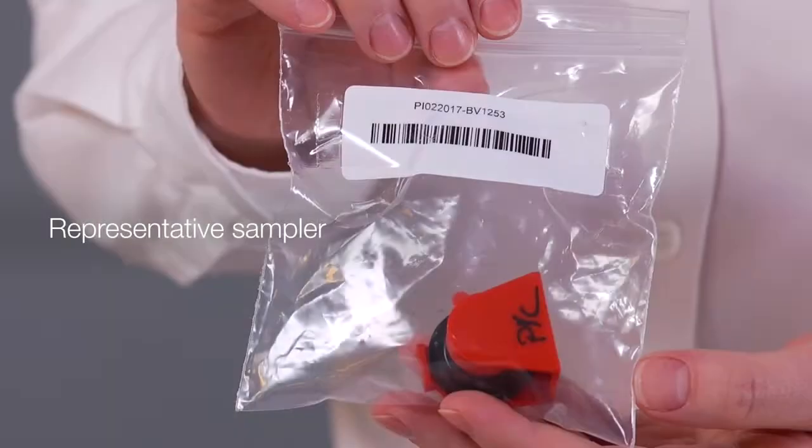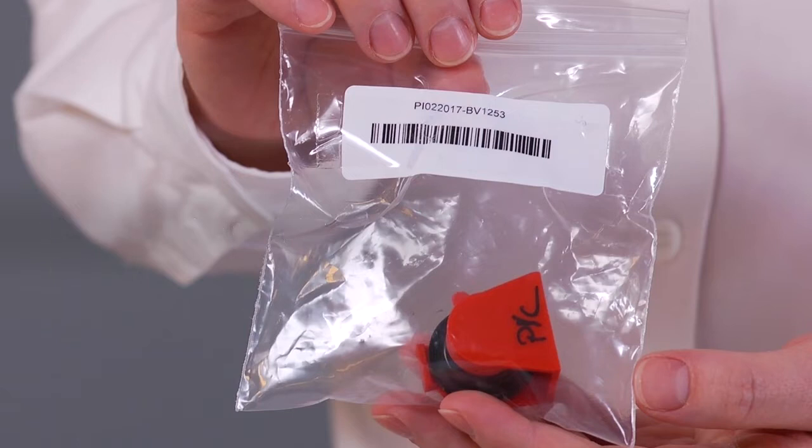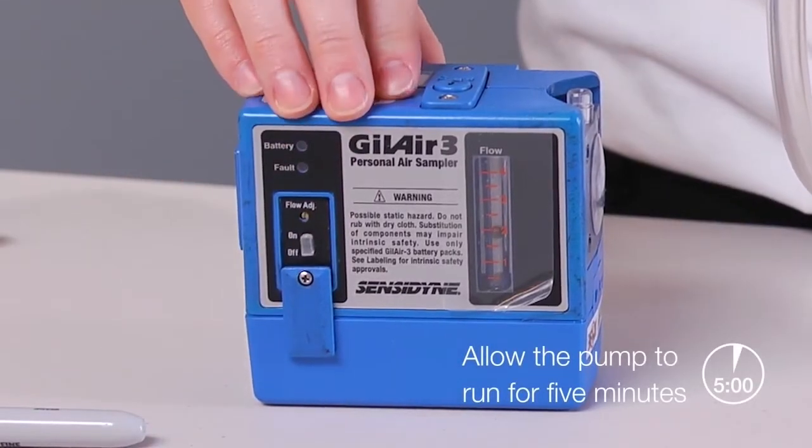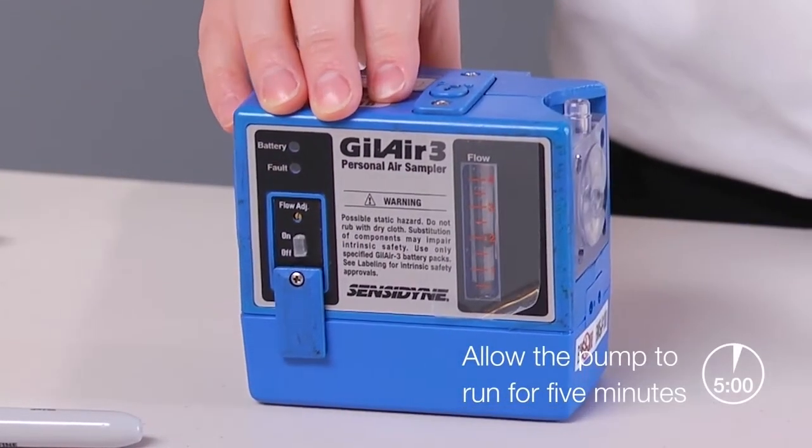Now we are ready to calibrate the pump for sampling. It is good practice to designate a representative sampler for calibration, which will be used and retained for post calibration, but make sure it's not used to collect an actual sample. Also allow the pump to run for about five minutes before you start.